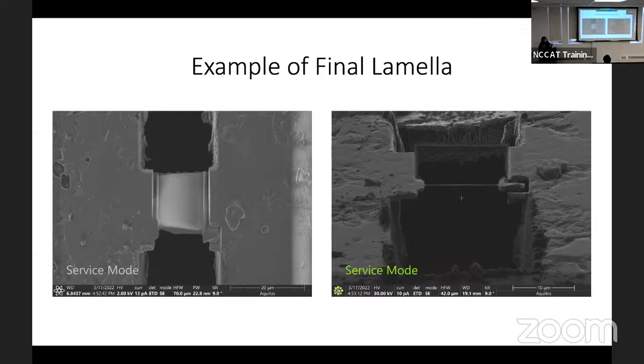It looks super nice and thin from the FIB view, from the overview of the SEM. You can't really see any features, but there's stuff there, trust me. And you can see that the leading edge just has a bit of GIS left, which is good enough. It could have milled through even longer and gotten thinner than this, but I think this looks pretty good.